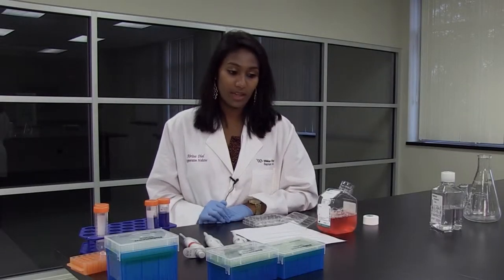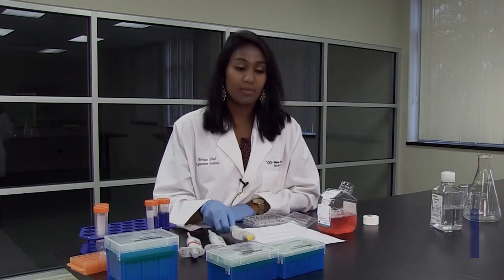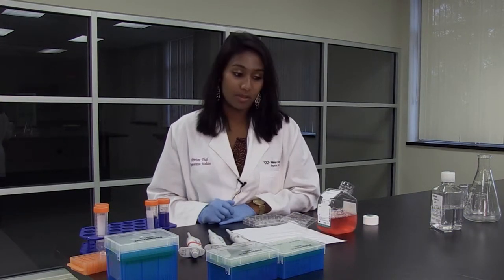There are three different kinds of micropipettes: the P1000, the P10, and the P200. Micropipettes are used to transfer small amounts of liquid, usually from 1 to 1,000 microliters.